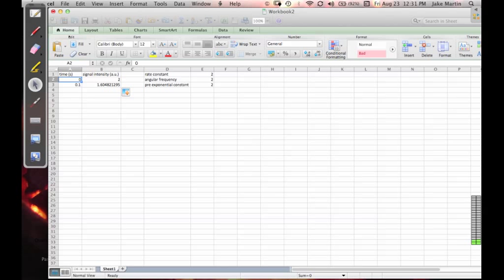Hello everybody. Today we're going to look at how to make Excel plots. Excel is a cheap and cheerful way of quickly making plots. As Jake will tell you, they don't look the prettiest, but because Excel, or some version of it, is on pretty much every computer you will find, it's very good for quickly visualizing either a function you haven't seen before or your data, and seeing what kind of shape your data is taking.